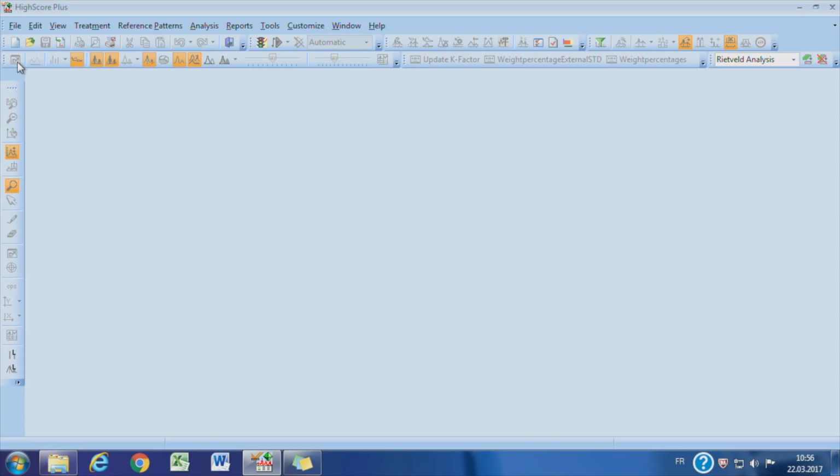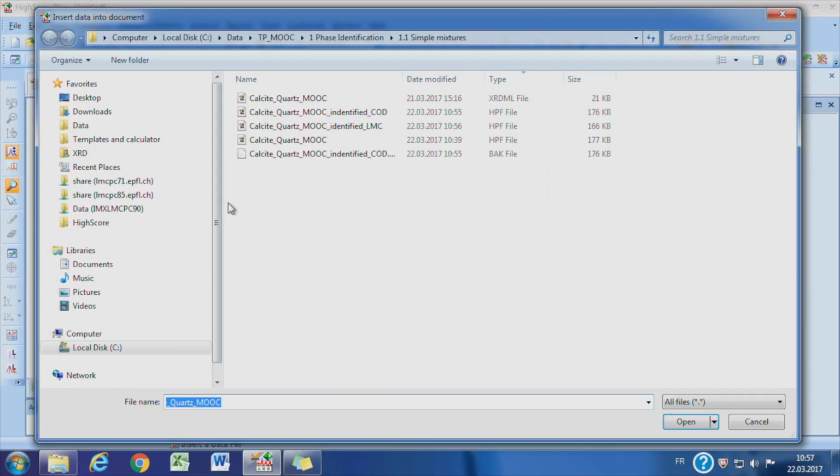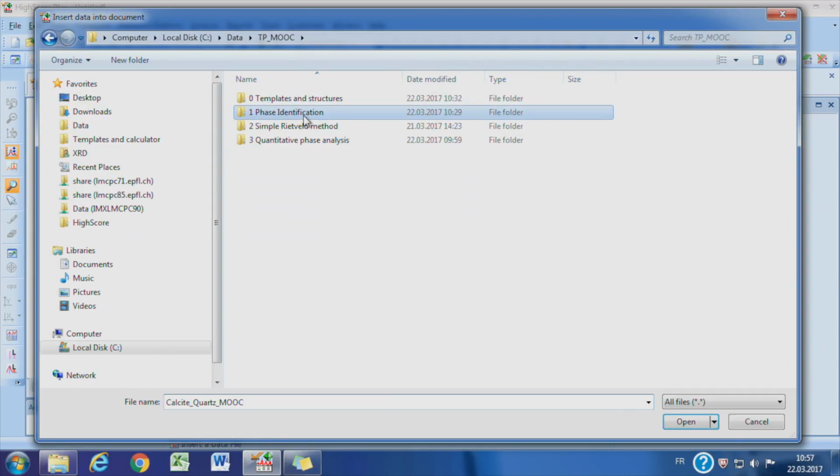Demo on fly ash and slag. For these 2 demos, we will show the typical patterns for the amorphous humps. As the samples are mainly amorphous with a small amount of crystalline phases, it is more challenging to make the decision of the final candidates in the samples if there is no information about the samples. For such kind of samples, the identification must be done with special care by taking as much information as possible, such as the chemical composition.